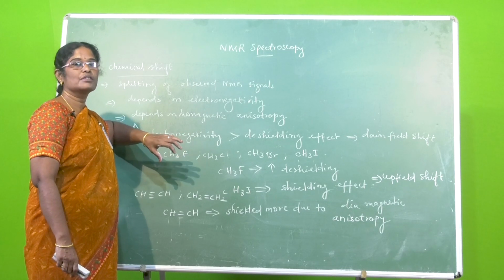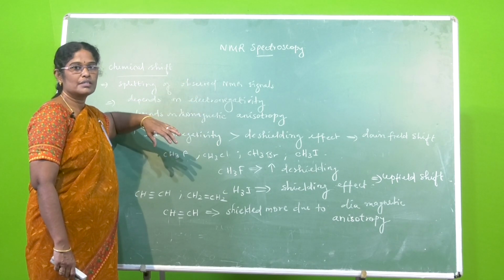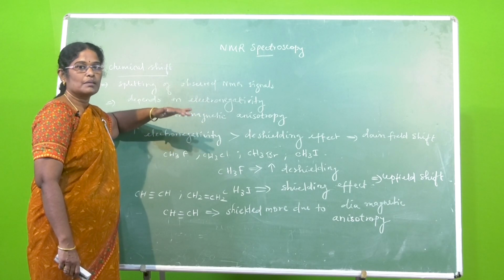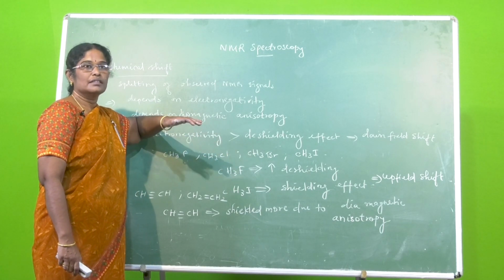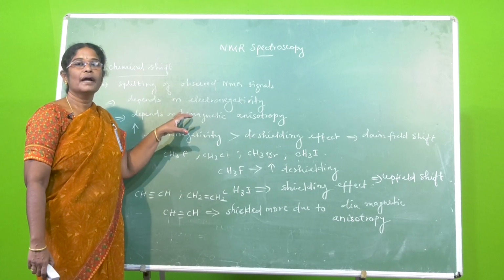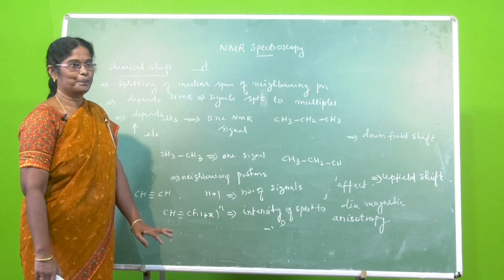But the actual observed values account for the parameter which we call diamagnetic anisotropy, which is mostly dependent upon the symmetry of the molecular system that interacts with the nuclear magnetic field that already prevails in the molecule and the external applied field, which is applied in a way that is perpendicular to the system, and the sample has a field or the lining up of the magneton values to oppose the external magnetic field. So these are the features of chemical shift, which arises because of the consequence of nuclear magnetic resonance.